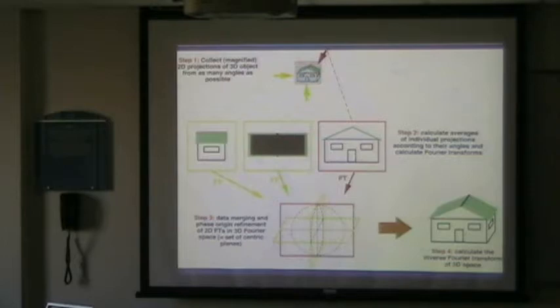So essentially, all kinds of 3D reconstruction methods we use in EM build on the fact that we produce different projections from as many angles as possible, and we back project them into a 3D space. And getting these projections right, knowing that this is the side, and knowing that this is from the roof, if you wish, or that this is from the front, this is the tricky part of getting the information right. And there's a lot of bullshit in literature, believe me, where things got screwed up. But that's the very fundamental way of how we do an image reconstruction.